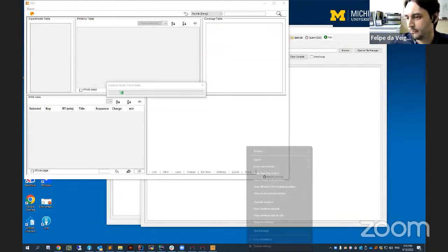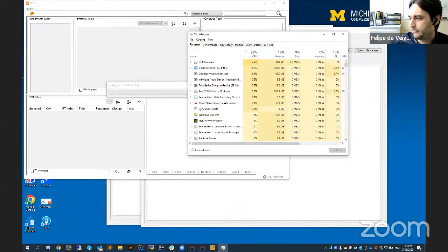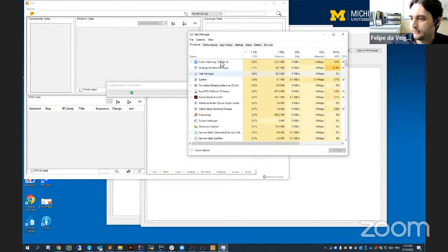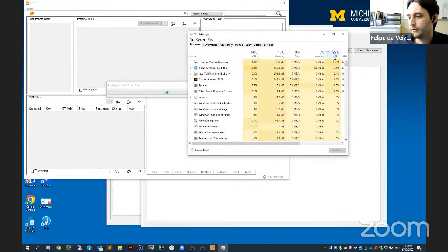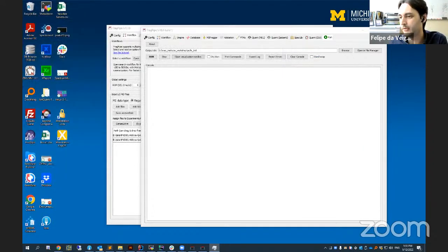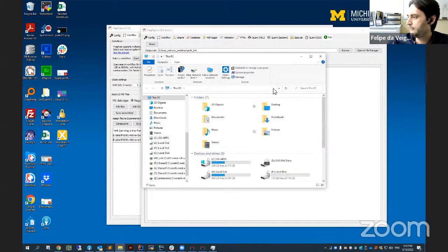While you're loading there, Fengchao, let me just answer a few other questions here. I see that Samantha and Silas are having issues with their program. It might be hard for us to help you debug the issues you're having with FragPipe right now. So what I suggest is to go to our GitHub, make an account if you don't have one, and open an issue describing the problem, and someone will be able to help you today.